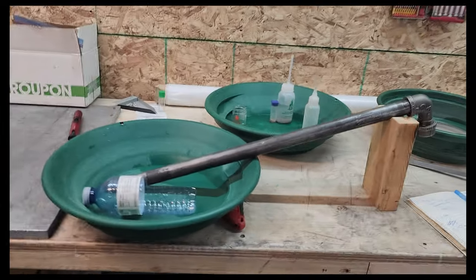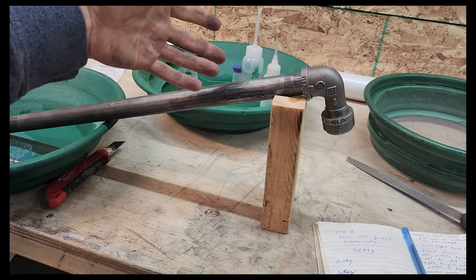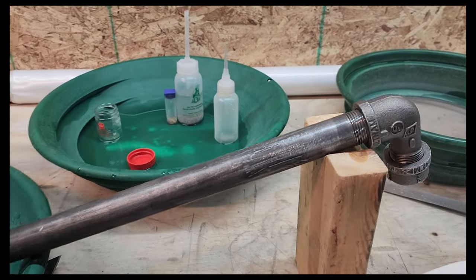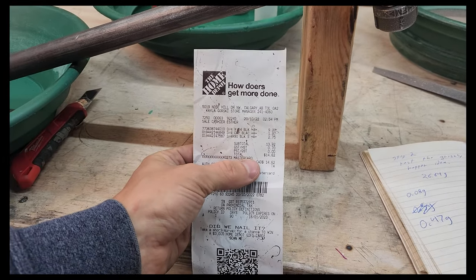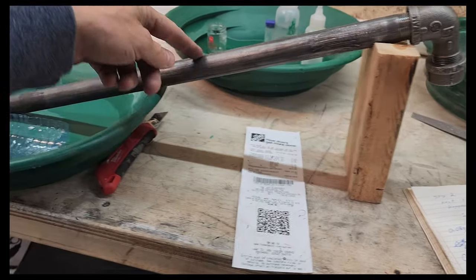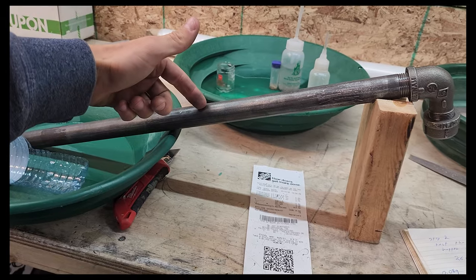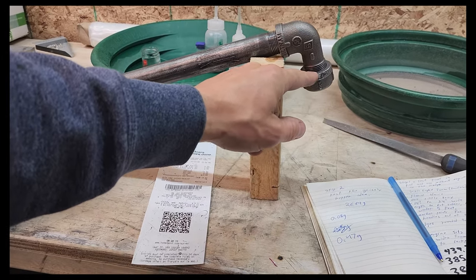So what I've done is tried to make the cheapest mercury still that I possibly can. Here is my receipt for $14.62. I have three-quarter inch black gas pipe, 24 inches long, an elbow here, and a little cup.